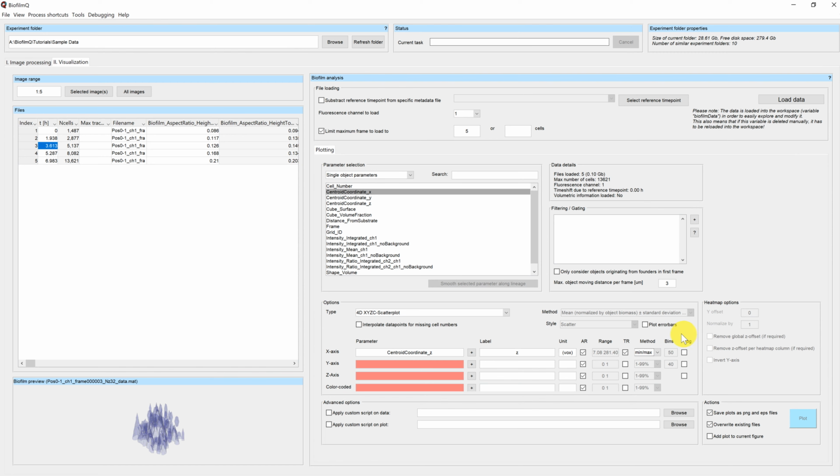Depending on your type of plot, you can also choose the number of bins. In an additional tutorial, the histogram tutorial, you can learn more about choosing the appropriate number of bins for your data. You can choose to display your axis logarithmically by checking the checkbox back here where it says log.